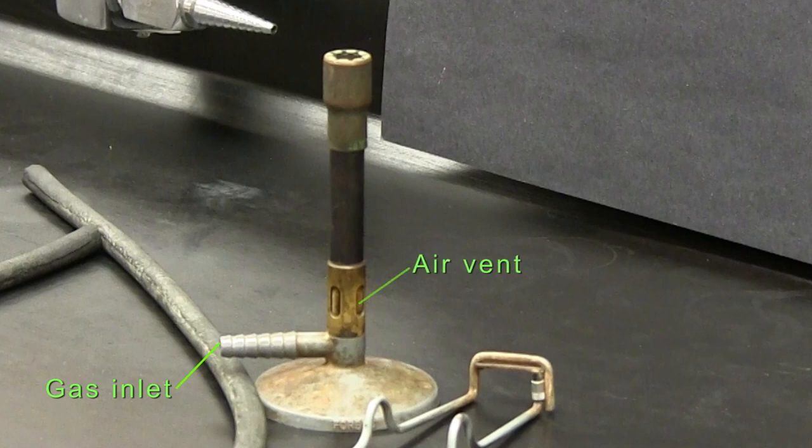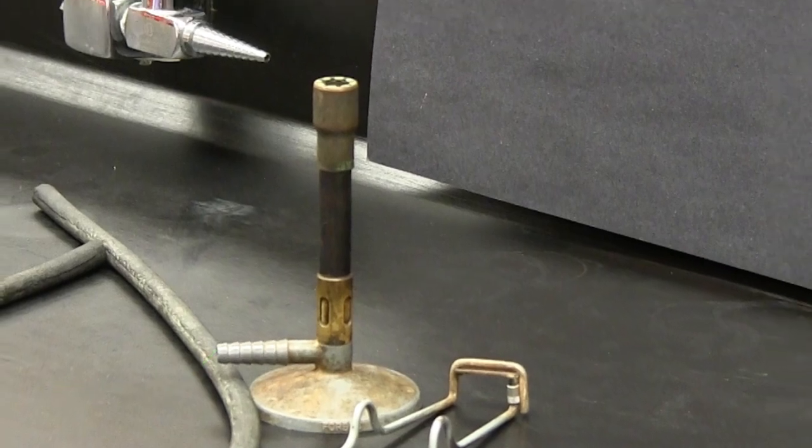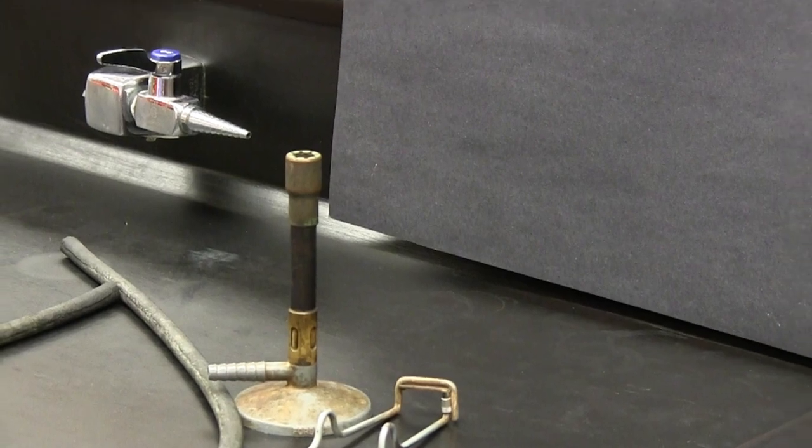The air vent at the bottom of the burner can be used to control the temperature of the flame. It's much easier to ignite the gas when the air vent is closed, so do make sure it's closed before starting.